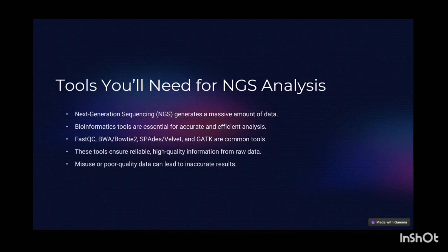Why this matters is that each of these tools plays a vital role in turning raw unfiltered data into reliable, high quality information. If any tool is misused, or if the initial data is of poor quality, the final result will be inaccurate, potentially leading to very bad conclusions in research or in clinical diagnostics. So these are some of the tools that we'll be using in NGS analysis.